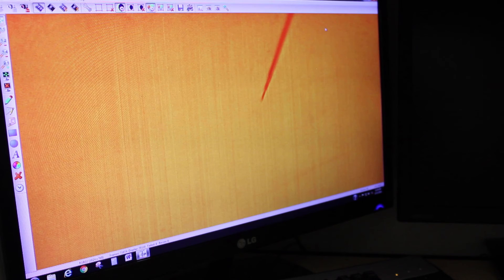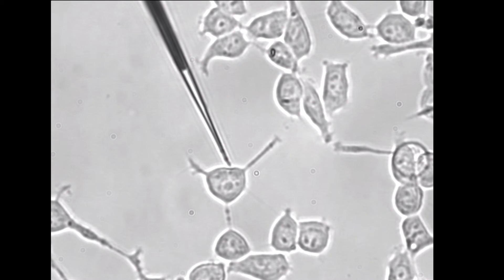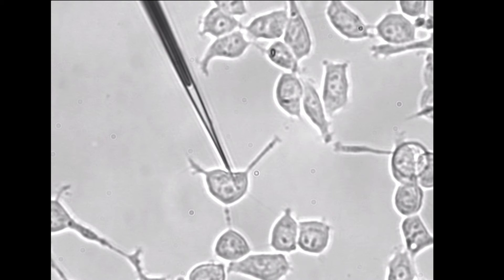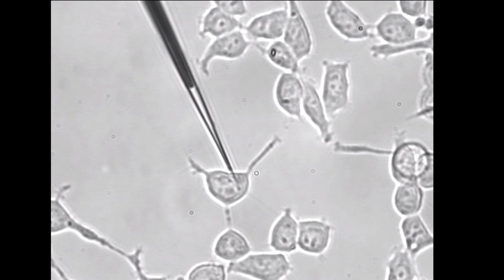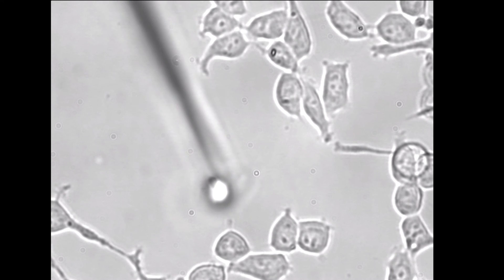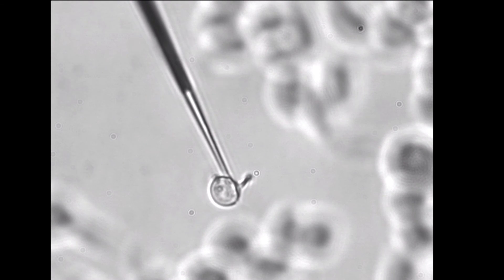In this demonstration, there is no cell on the cover glass. But in the actual experiment, there is a cell on the cover glass. Now we are approaching the cell. We continue and we can see it go inside the cell. The cell is a little bit deformed. Actually, it is not a good thing to see this deformation — it may show some damage to the cell. Because the cell size is around 10 microns and our pipette apex is around a few hundred nanometers, if you insert too much, it may hurt the cell. If we retract our pipette, we can see the cell go with our pipette, which means the attachment of the cell to the cover glass is not very good. Later on, we will do some modification to make the cell attach to the cover glass better.